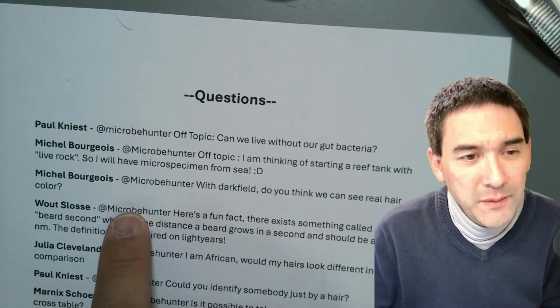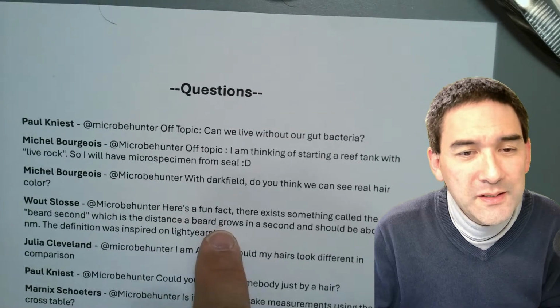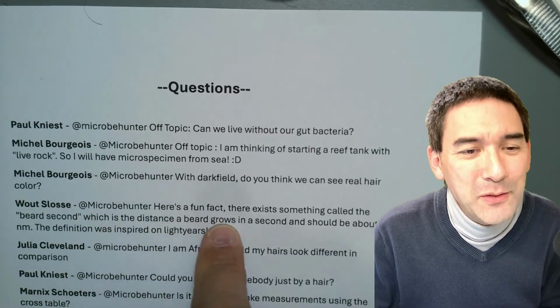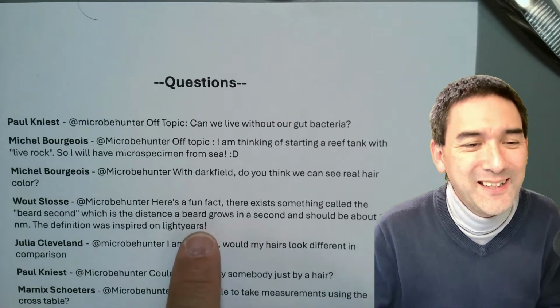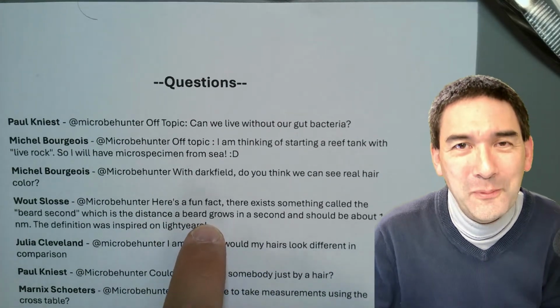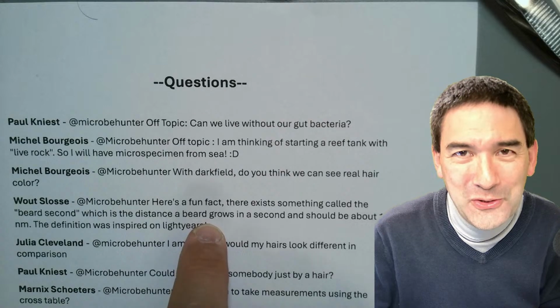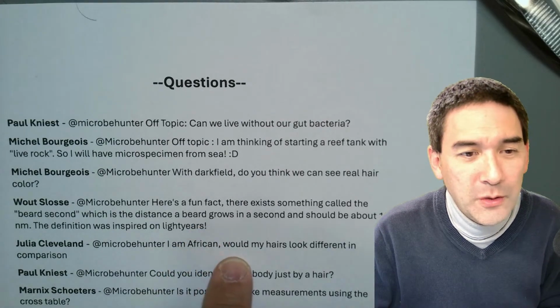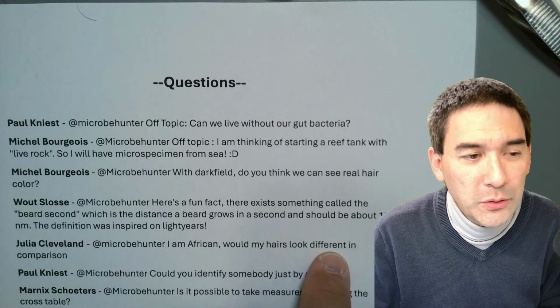Yeah. Here's a fun fact: there exists something called the beard second. Yeah, I read about that, which is the distance the beard grows in a second. Yeah, and we determined now how many micrometers it grows in a day. We can easily calculate how many in a second. Yeah. So the question is if the hair would look different in comparison.